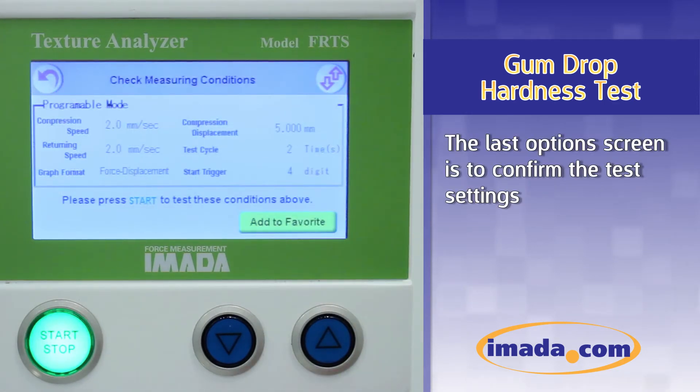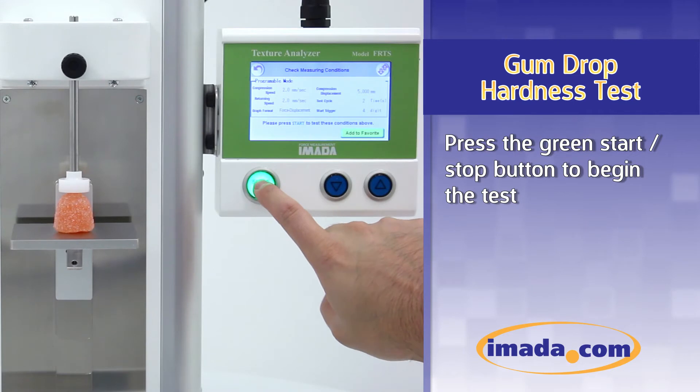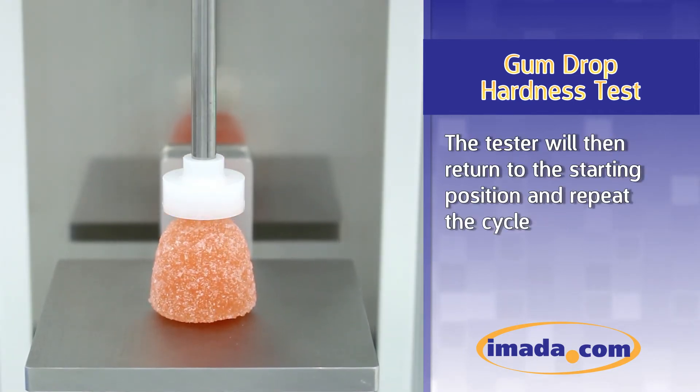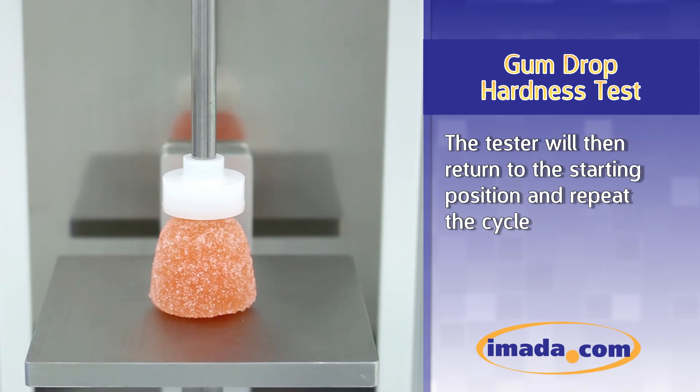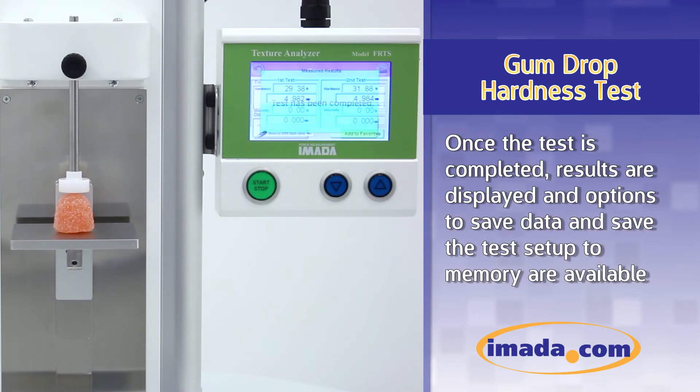The last option screen is to confirm the test settings. Press the green start-stop button to begin the test. Once contact is made, the tester will compress the gumdrop to 5 millimeters. The tester will then return to the starting position and repeat the cycle. Force, speed, and displacement readings are displayed on the touchscreen during the test. Once the test is completed, results are displayed, and options to save the data and save the test setup to memory are available.